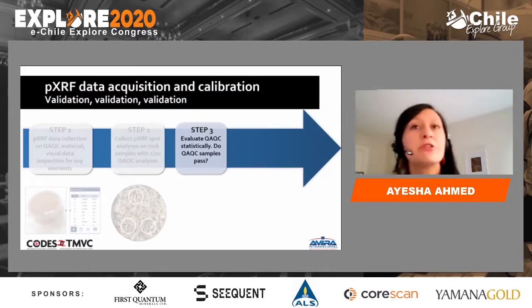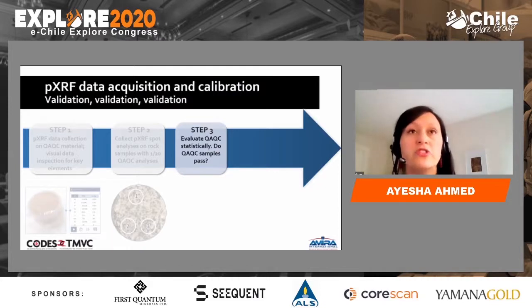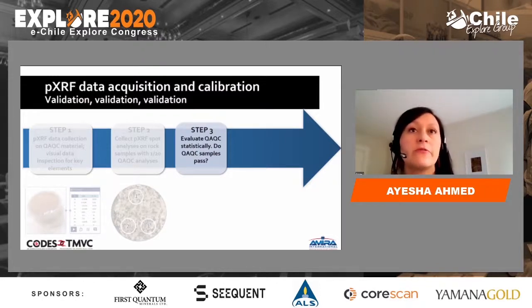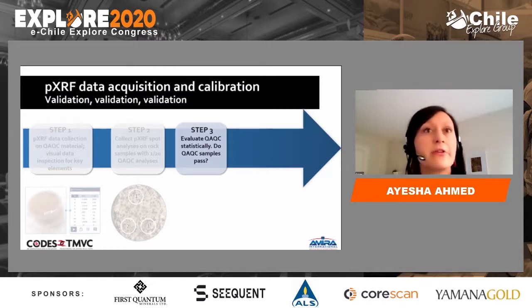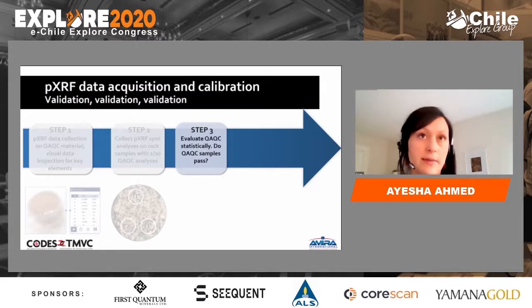All right, so we're back to the workflow. The next few steps are absolutely crucial to generating good data, but I'm not going to dwell on them because there have been many studies published on the importance of validating QA/QC samples and generating calibration curves. So definitely email me if you're looking for specific references. Suffice it to say that standard and blank analyses from the data collection campaign need to be evaluated to ensure they pass previously determined acceptable thresholds.